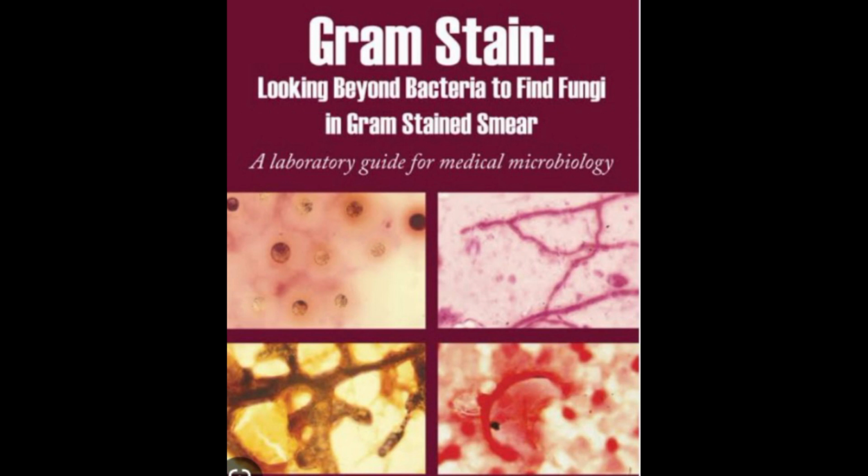4. Cover the slide with gram iodine and leave it for 1 minute. 5. Wash the slide with water. 6. Decolorize quickly with acetone, rocking the slide gently. 7. Wash with water immediately. 8. Counterstain with dilute carbol fuchsin for 30 seconds. 9. Wash with water and blow dry.